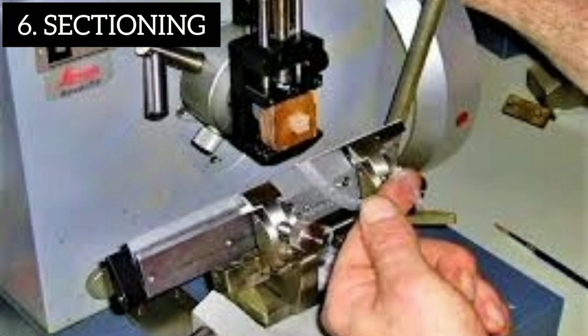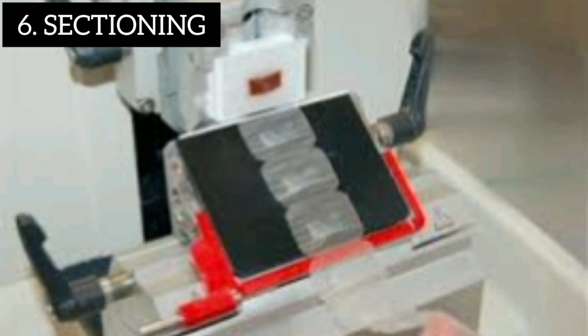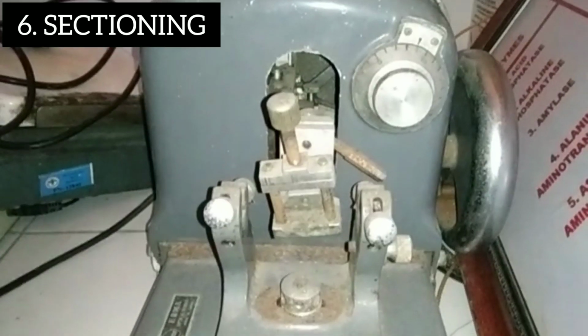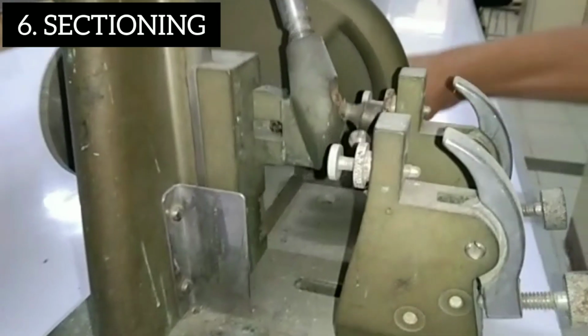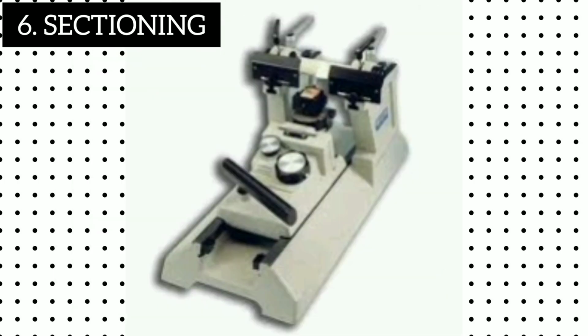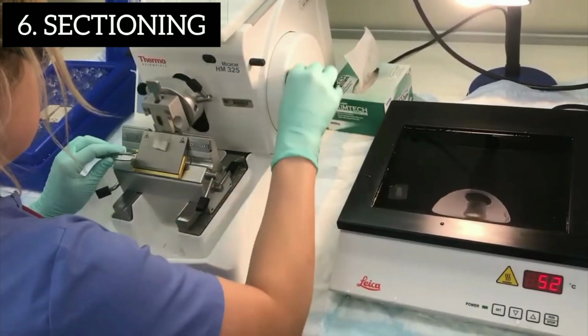Sectioning or microtomy is the process of cutting the tissue blocks into microthin slices of tissue ribbons using a microtome. A microtome is a mechanical instrument used to slice or cut biological specimens into very thin sections or segments for microscopic examination, usually around 3 to 5 micrometer in thickness. The type of microtome that can be used is dependent on the type of specimen that will be sectioned.